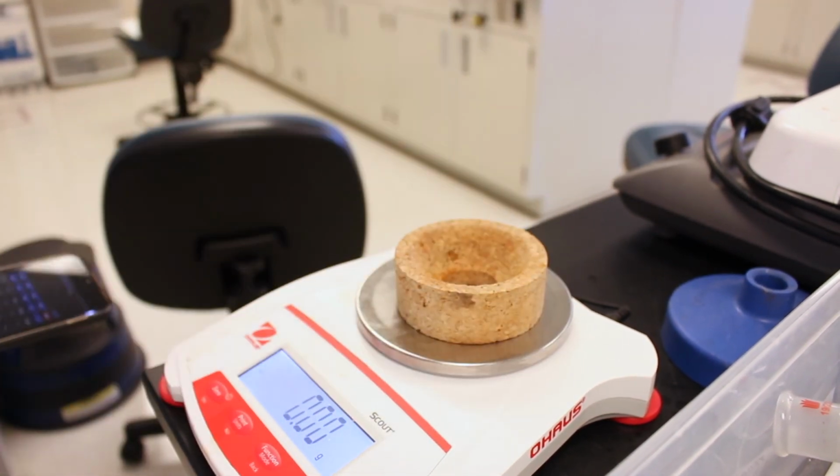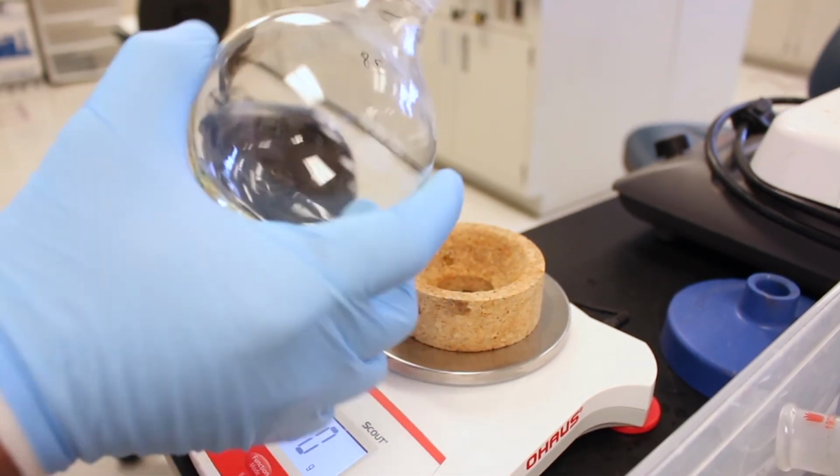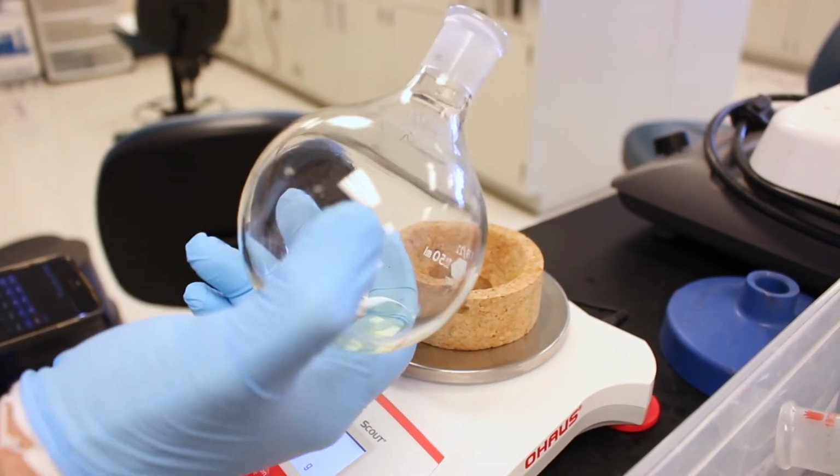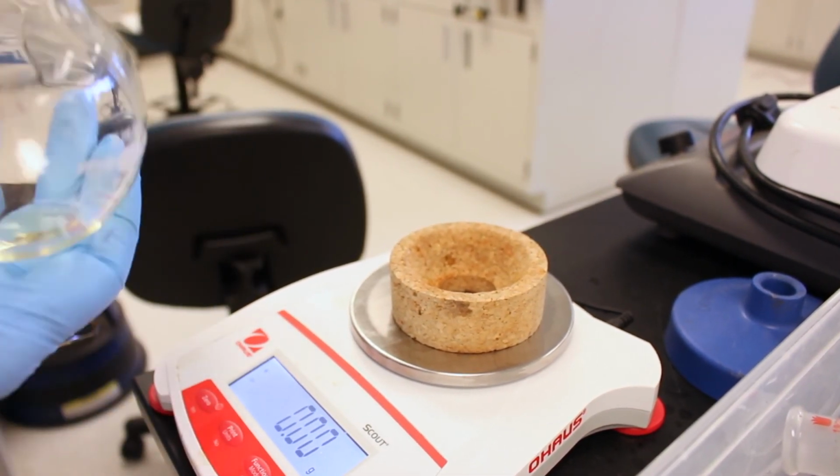And if we smell this, yep, it smells like Christmas in a flask. It always makes the lab smell good. So we'll see you all next week. Calculate your percent recoveries from that mass, and we'll see ya.